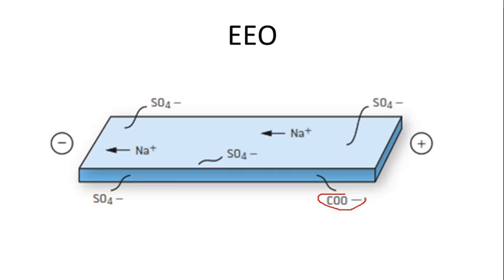Suppose you are using starch, with the carboxylic group as a fixed group. When it is ionized in the buffer, the group is always attracted to the anode. This is electroendosmosis 1.